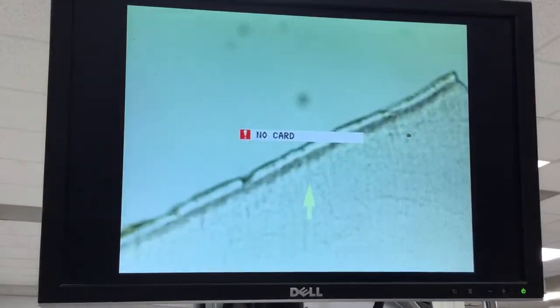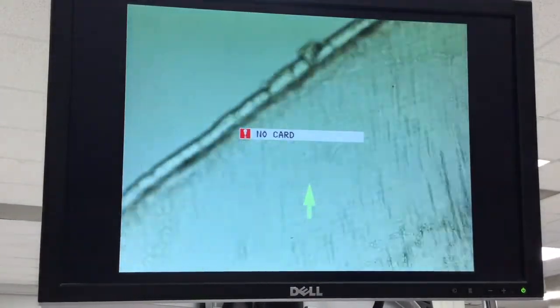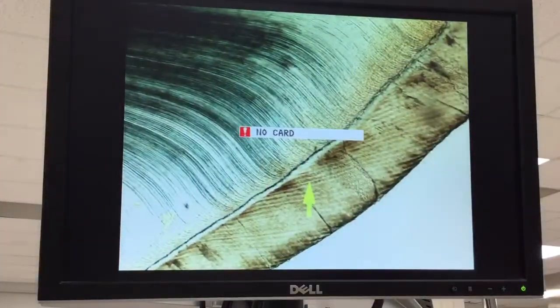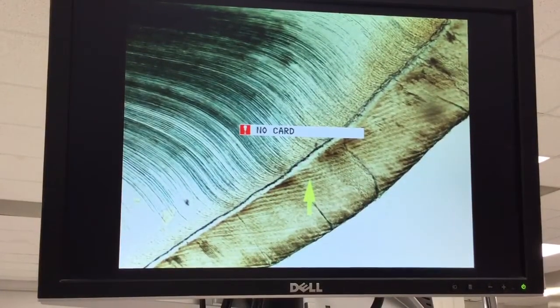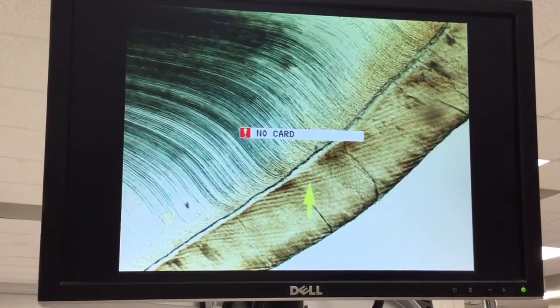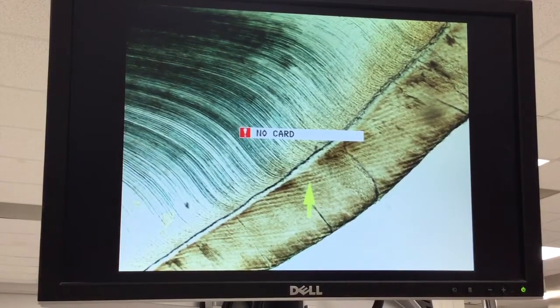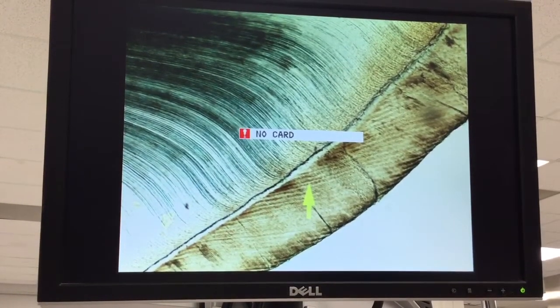As we come down, here we've got some dentin, so we'll find that enamel. And right there, right off the bat, what are those lines that we see right there? Those are the lines of Retzius.